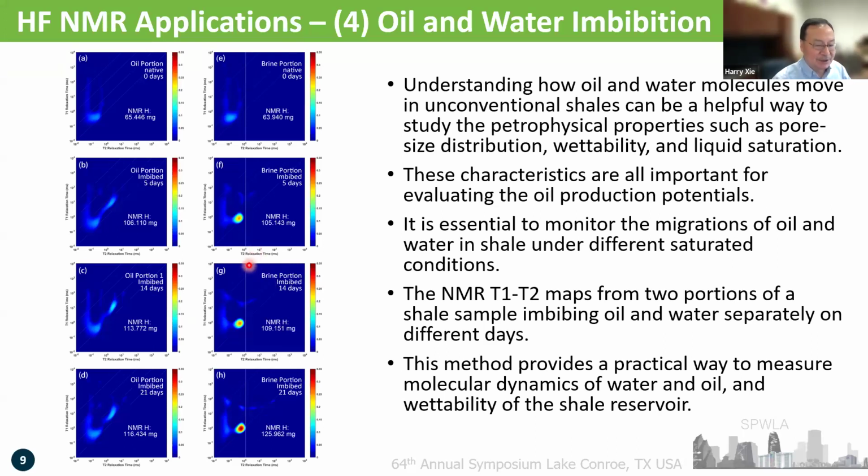You can do a saturation study to understand what happens when you saturate a shale sample. One question you need to ask is, is it 100% saturated? How are you going to confirm that? People normally start with a sample and measure porosity, and then saturate with brine or oil to see if they can reach 100% saturation. We can use NMR to do this monitoring.